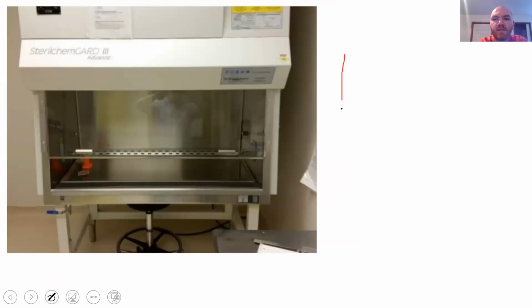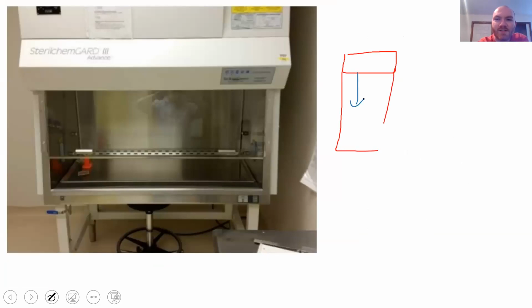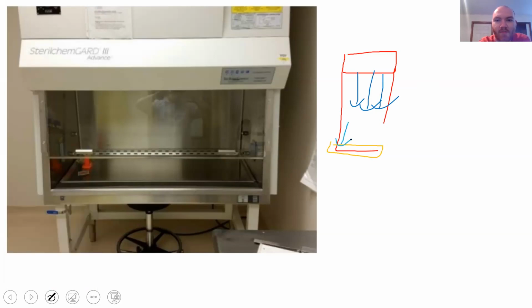Now, these are pretty conceptually similar to the laminar flow hoods, the horizontal things, just turned 90 degrees in terms of airflow anyway. So the airflow is coming down, and again, it's a laminar sheet. It's all coming down, and then you're going to have air returns that'll essentially suck out the air as it reaches the bottom. These run along the back, and along the front.